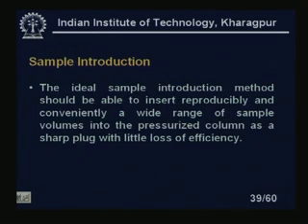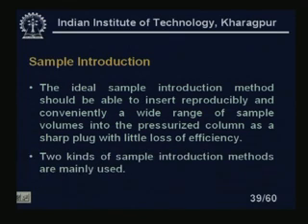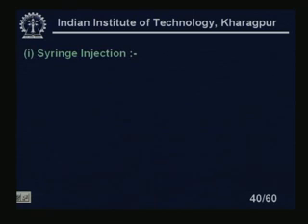Sample introduction. The ideal sample introduction method should be able to insert reproducibly and conveniently a wide range of sample volumes into the pressurized column as a sharp plug with little loss of efficiency. Two kinds of sample introduction methods are mainly used. One is syringe injection.